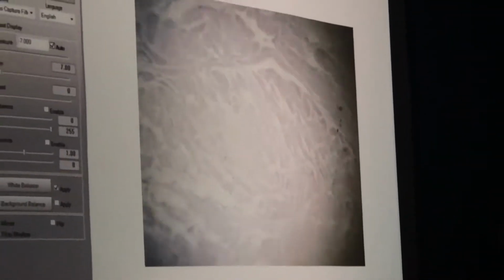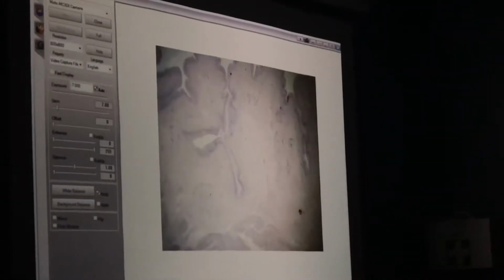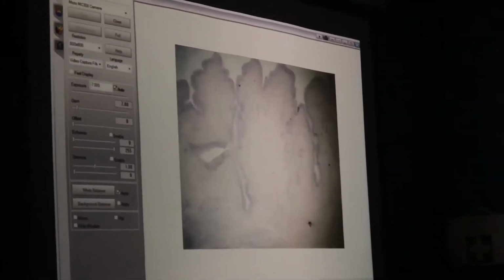Transitional epithelium again. So if I just kind of scan through this slide here, I can see there's a whole bunch of different stuff on here. Most of it, though, is going to be the same thing. So this is going to be the lumen of my bladder. I'm going to have not the entire thing, but a little chunk through the bladder, so it sort of ends there, sort of a little piece of the bladder wall, and then it ends over here.